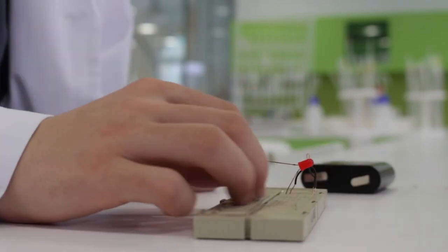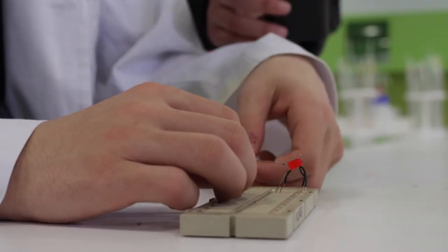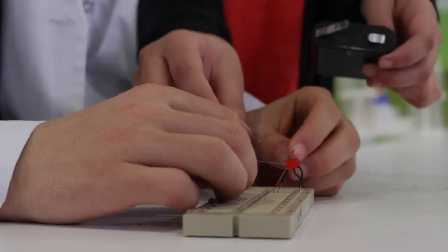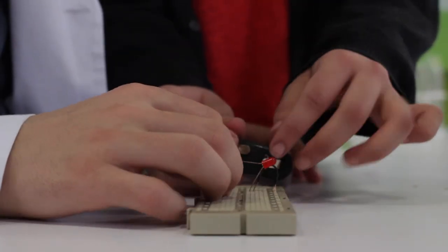We'll repeat the process with the other two materials. In this case, graphite, given the small size of the particles used, is hard to attach to the circuit. Once this is done, we'll see if it's a good conductor.